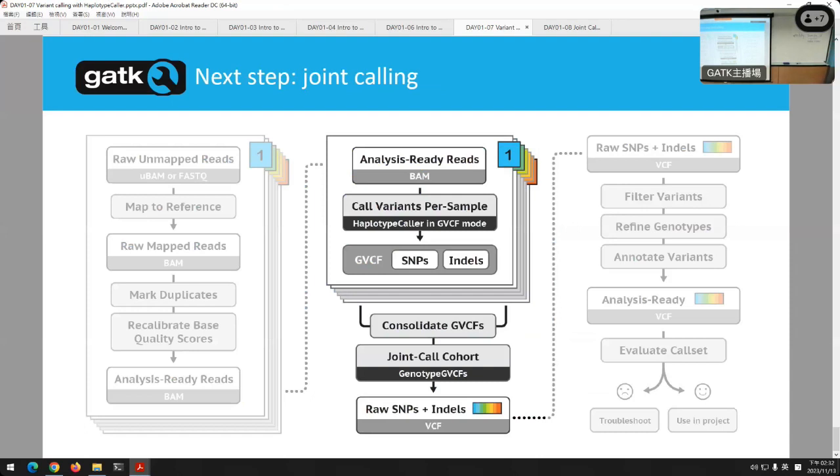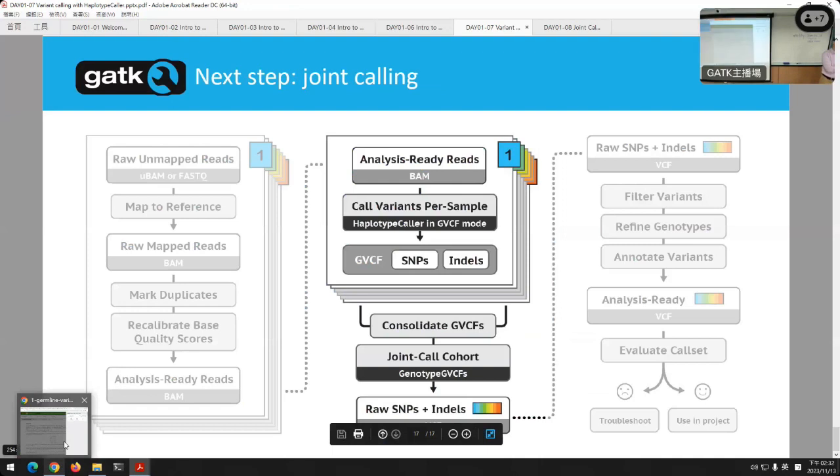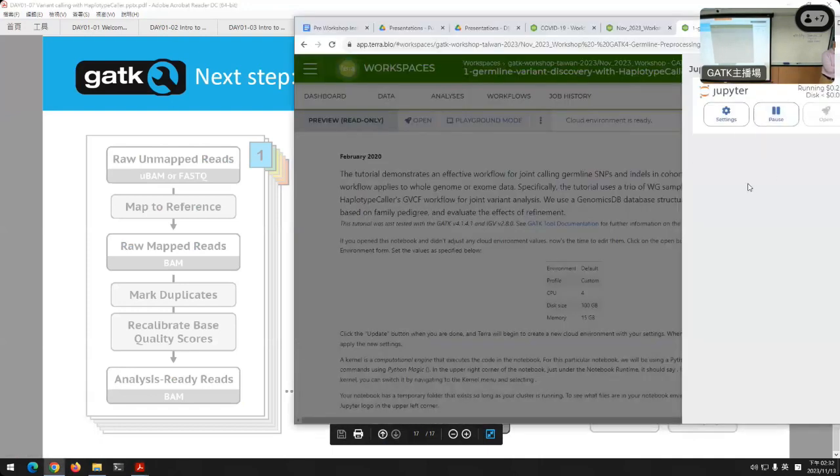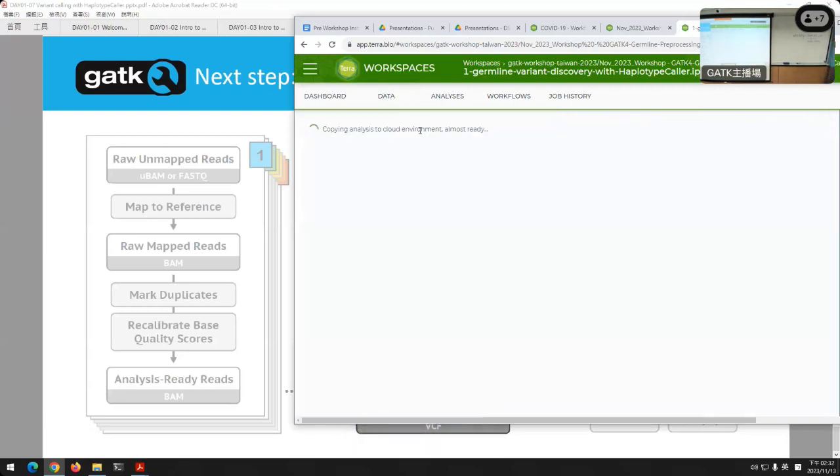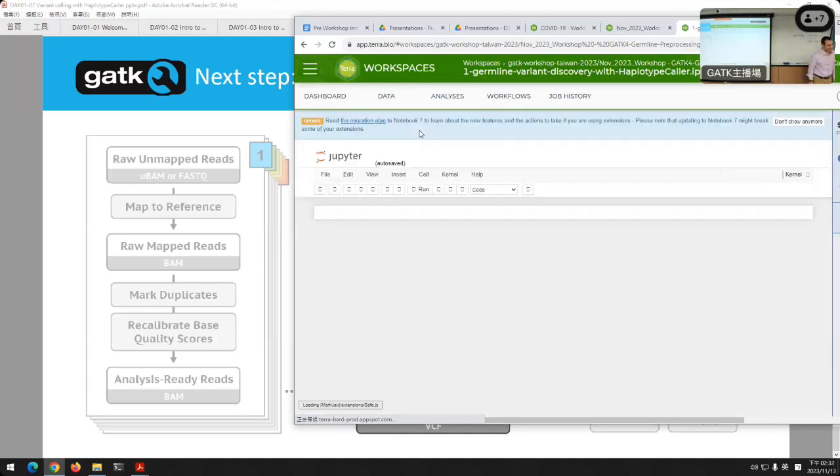Hi, Eric. Hi, team. I have one question about the HaplotypeCaller. You put a lot of resources to assemble the haplotypes, and the output VCF file, does it have the information of the haplotypes? Because we need the haplotype in the regional scale, not the global scale. It is enough, but do you have the information?